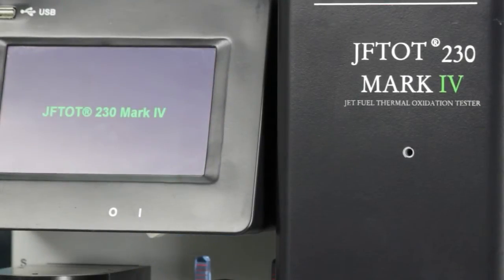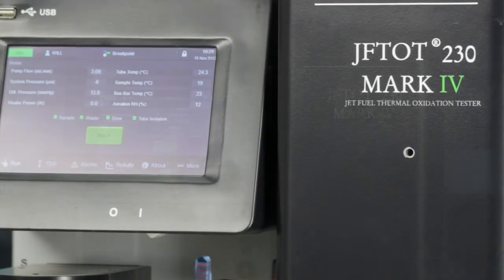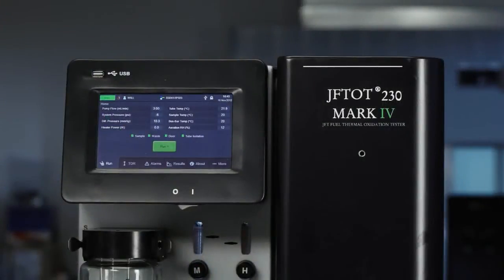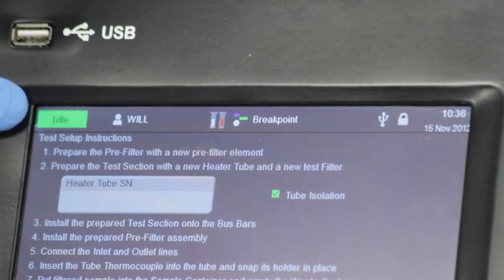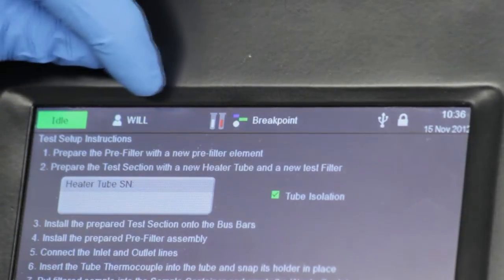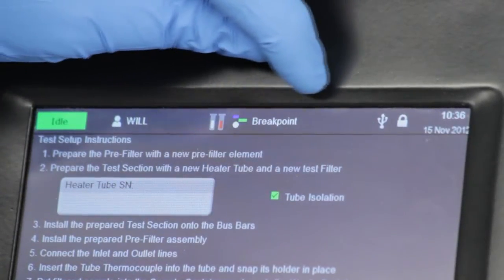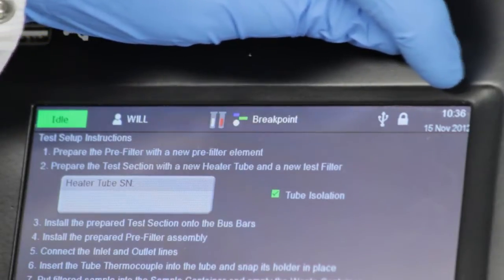After you press the power button, the first screen you'll see is the home screen. If you look at the top of the screen, you'll see the status bar. You'll be able to see the status bar on every page.